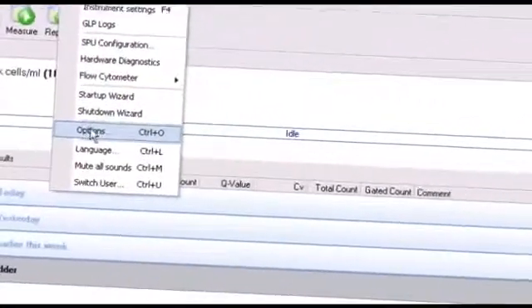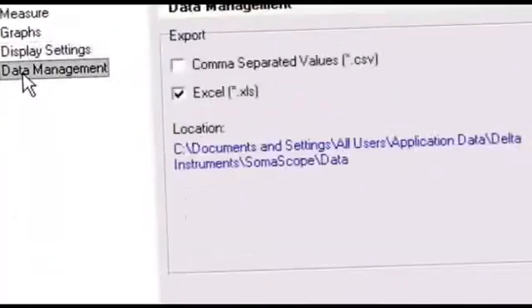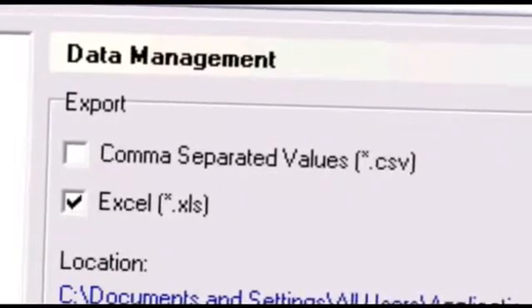There is a possibility of creating and setting up personal favorites for colors, column settings and text settings. Results can easily be transported to Excel for further processing.